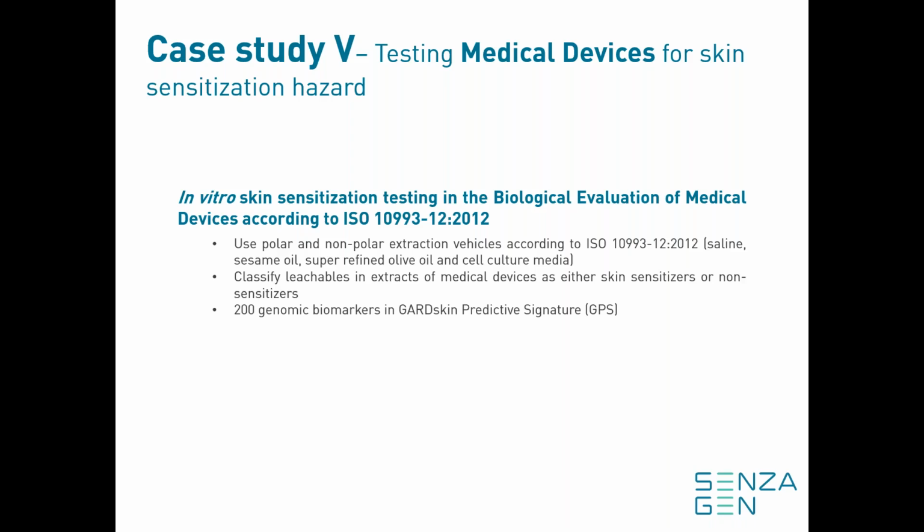To comply with these standards, we have implemented an extraction procedure using both polar and non-polar extraction vehicles, and the intention is of course to classify the leachables from the medical device in both of these two vehicles using the conventional GARD skin assay. All these procedures are stated exactly in the ISO standard on how you should do this type of testing.